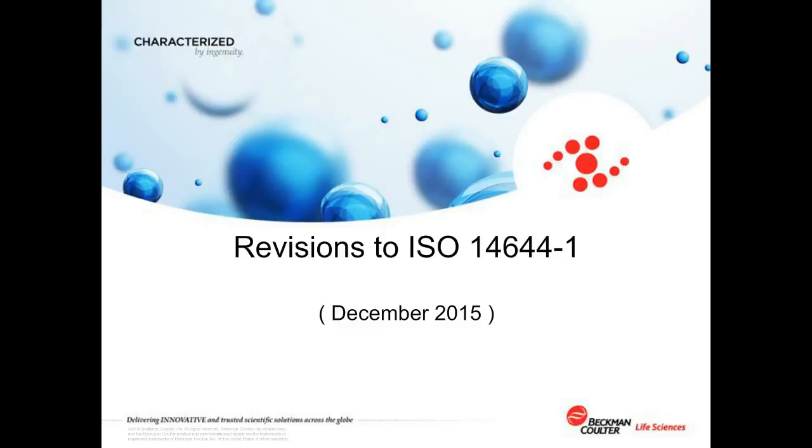Well, in a sense, not a tremendous amount. It's important with most standards not to make radical differences unless for some reason the methods or technologies have shifted substantially. So you wouldn't say that it made big differences, but it did make a few. And I wanted to just briefly touch on those as we discuss this and its relationship to 21501.